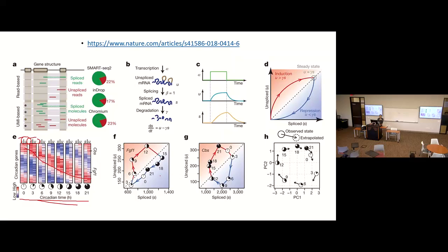this scatter plot, and they know, okay, when this gene has been upregulated in the early morning, for example, it starts to show up in this corner of the scatter plot. Then when you move, this gene starts to slow down transcription, and it starts to move to this corner of the scatter plot. All right, I hope you get the idea about this. And it's a very, very powerful approach.